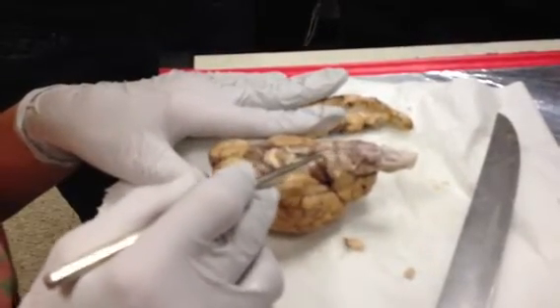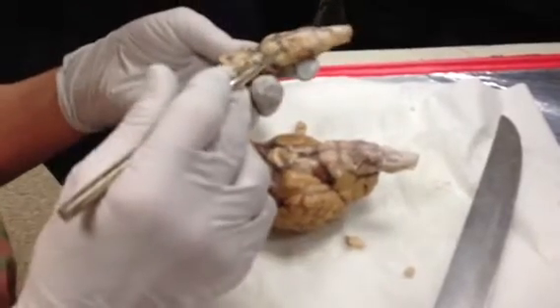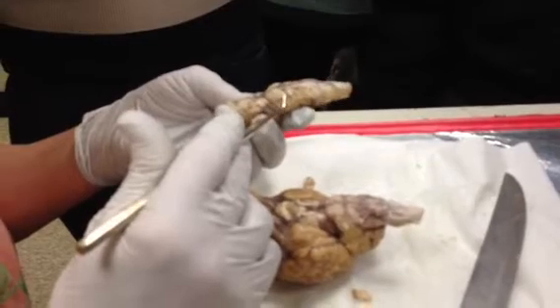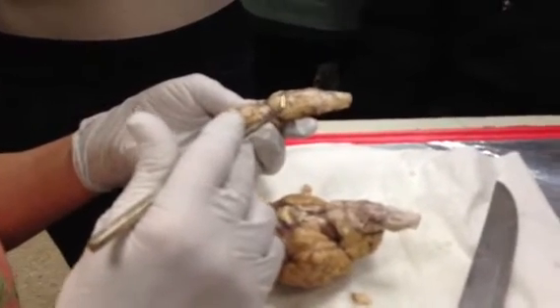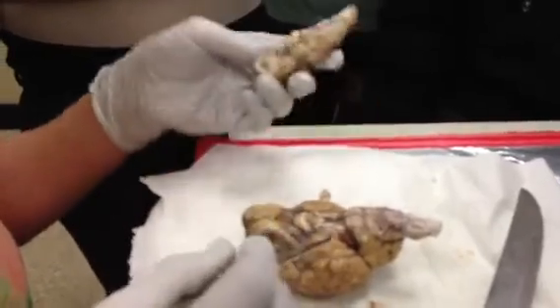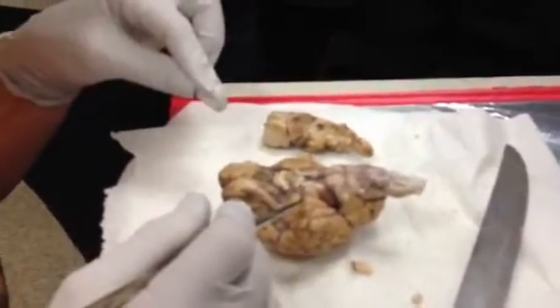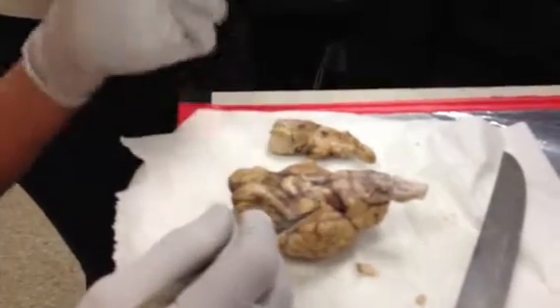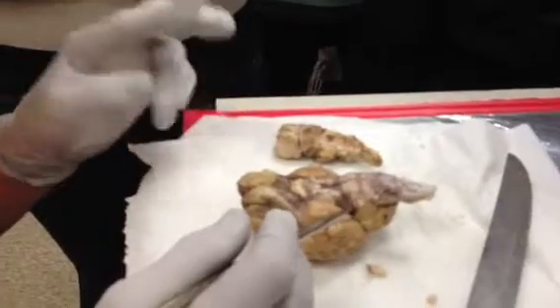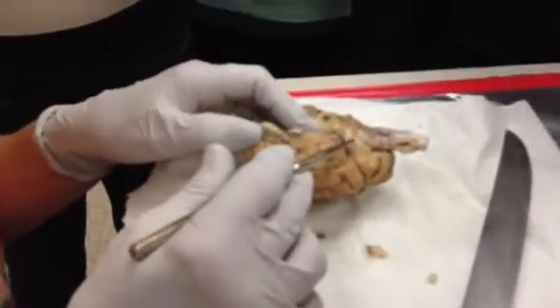It doesn't look like I've got an abducens nerve. I do have an abducens nerve right there. This is number 6. Isn't the oculomotor 5? No, oculomotor's 3. Oculomotor's 3? Old opticians often. So you go O3T2. So trigeminal is number 5. Trigeminal would have attached here.